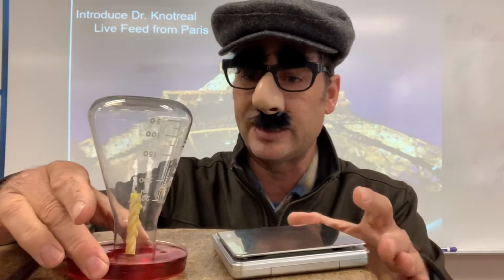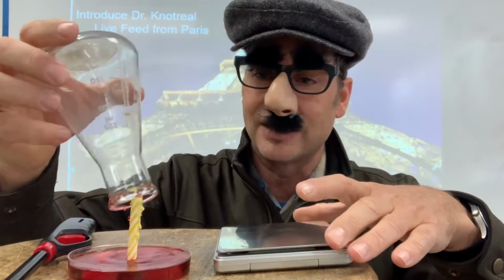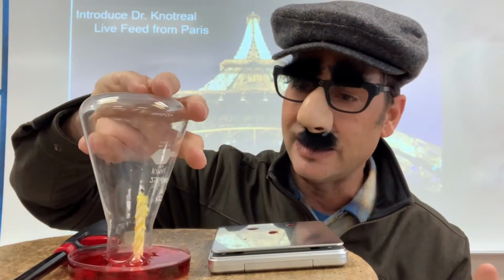You could very carefully take the mass of the entire thing, or just the mass of the flask, or just the mass of the candle and the hex nut, like this. And you will write those things down in the observations across from your diagram.